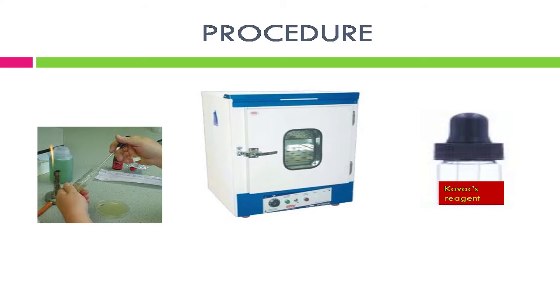Procedure: inoculate the tube by taking the bacterial culture into peptone water. Incubate the tube at 37 degrees Celsius for 24 to 48 hours. Add 0.5 ml of Kovac's reagent to the broth culture. Observe for the presence or absence of a ring.